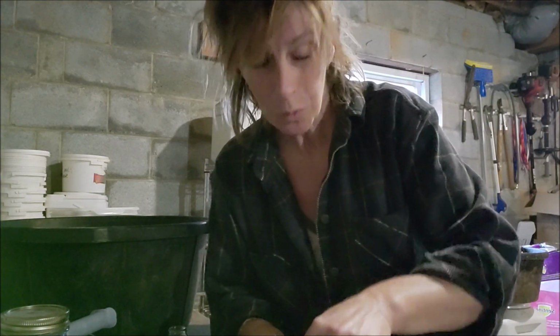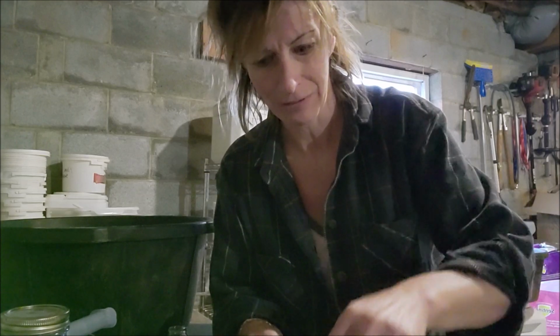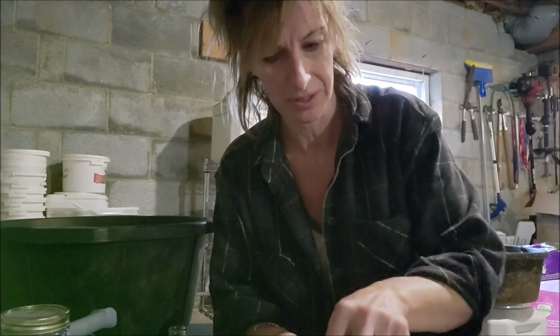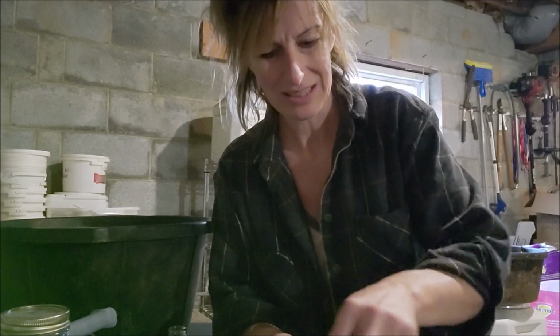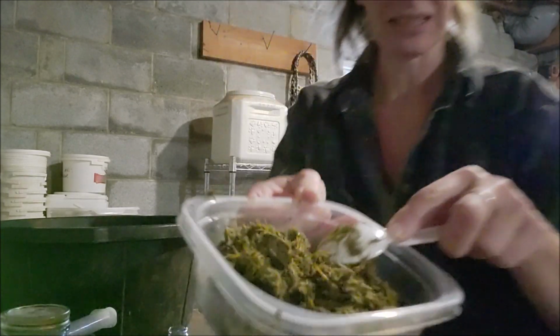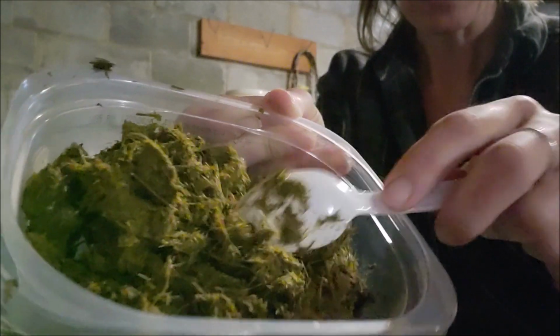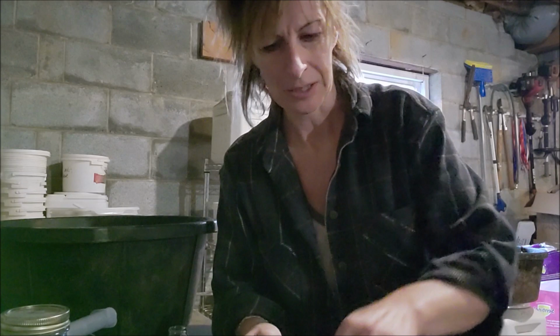This is not like human poop or dog poop. It's mostly grass. Horses don't eat anything else like honey buns or steak or anything. So it's less sticky, and it's pretty dry. I mean, you can see in here all the little bits and pieces of hay and grass that he's eaten.